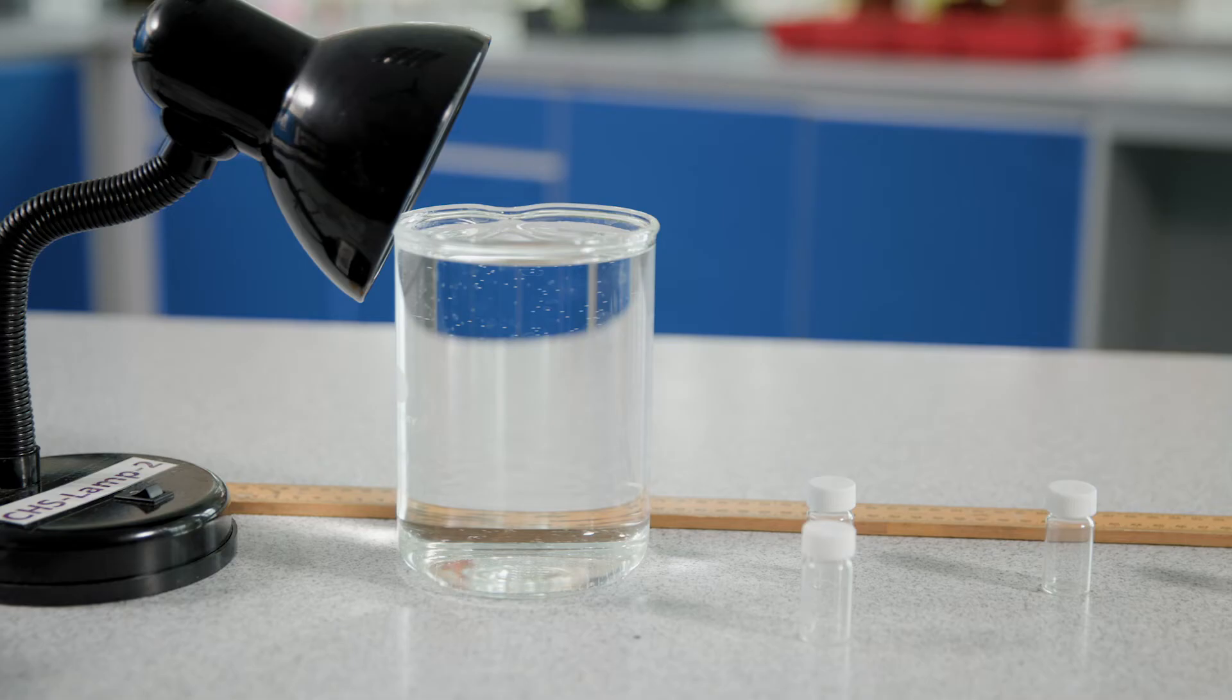Make sure you also set up a control variable. To do this, set up a heat filter between the lamp and where you will place your tubes. The heat filter is a water-filled clear container.